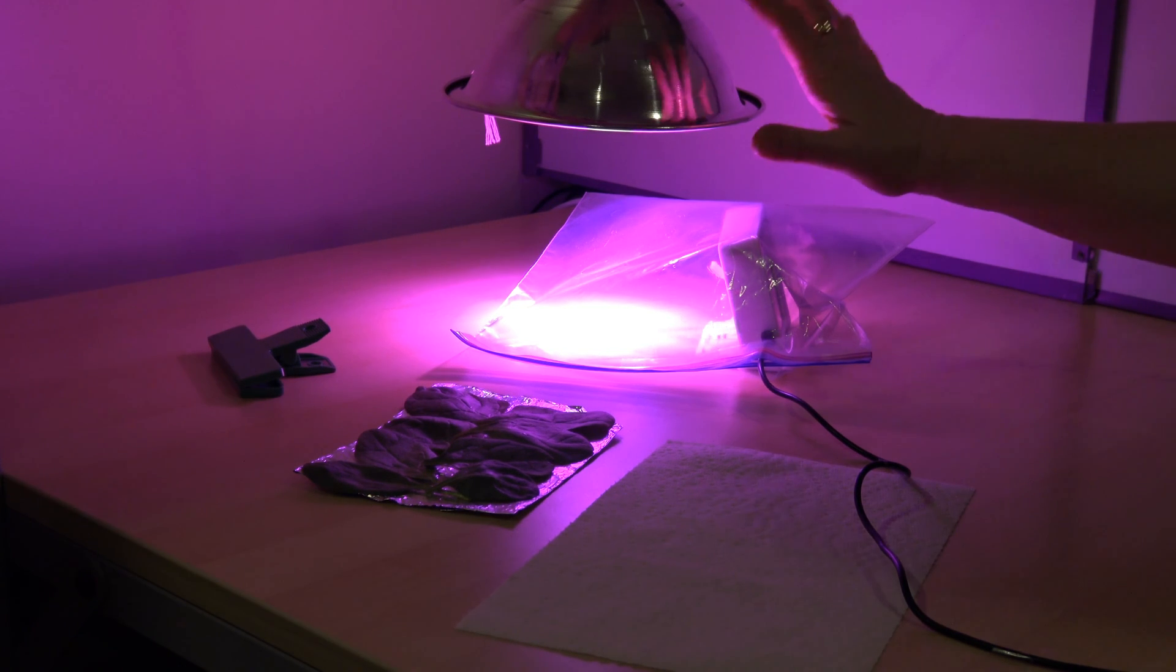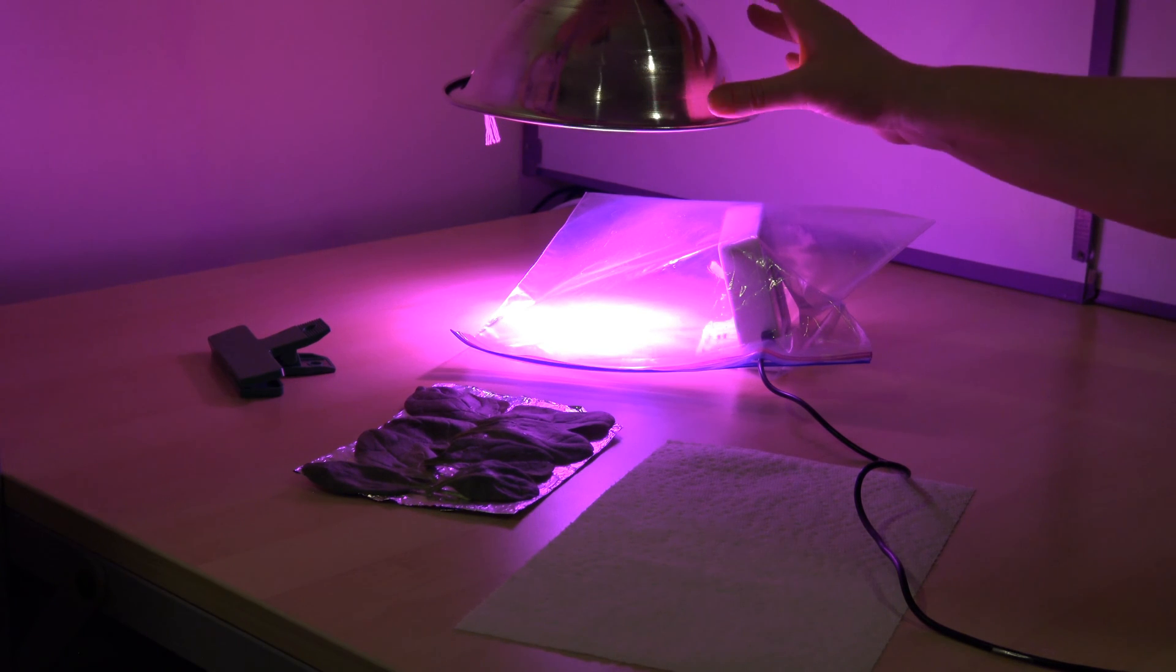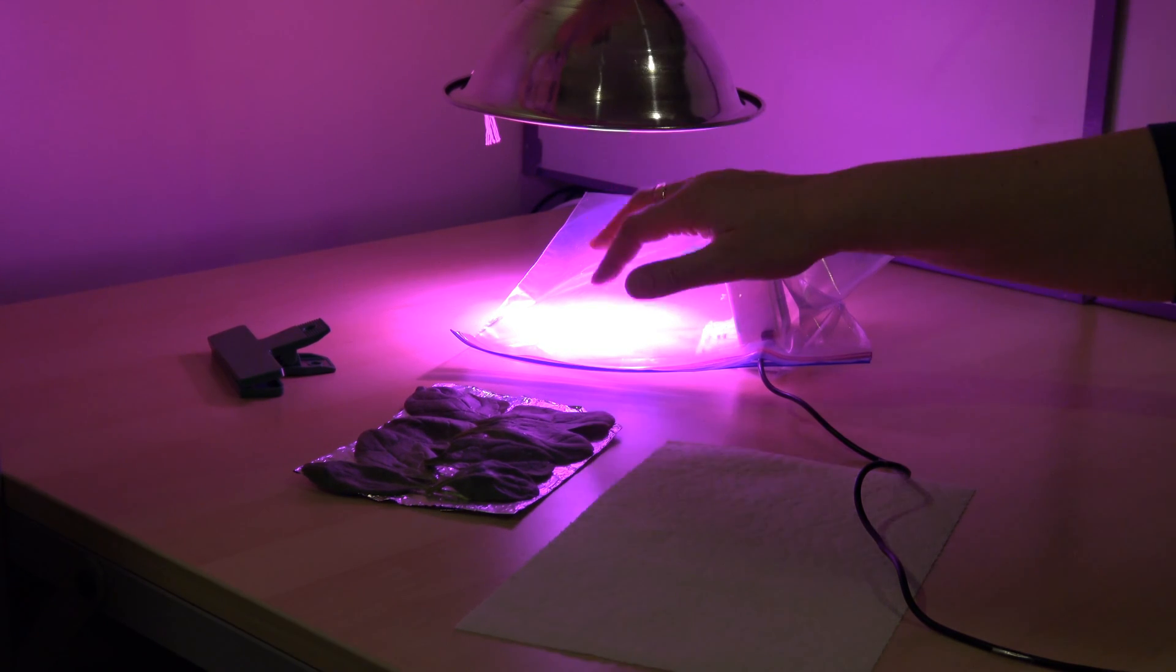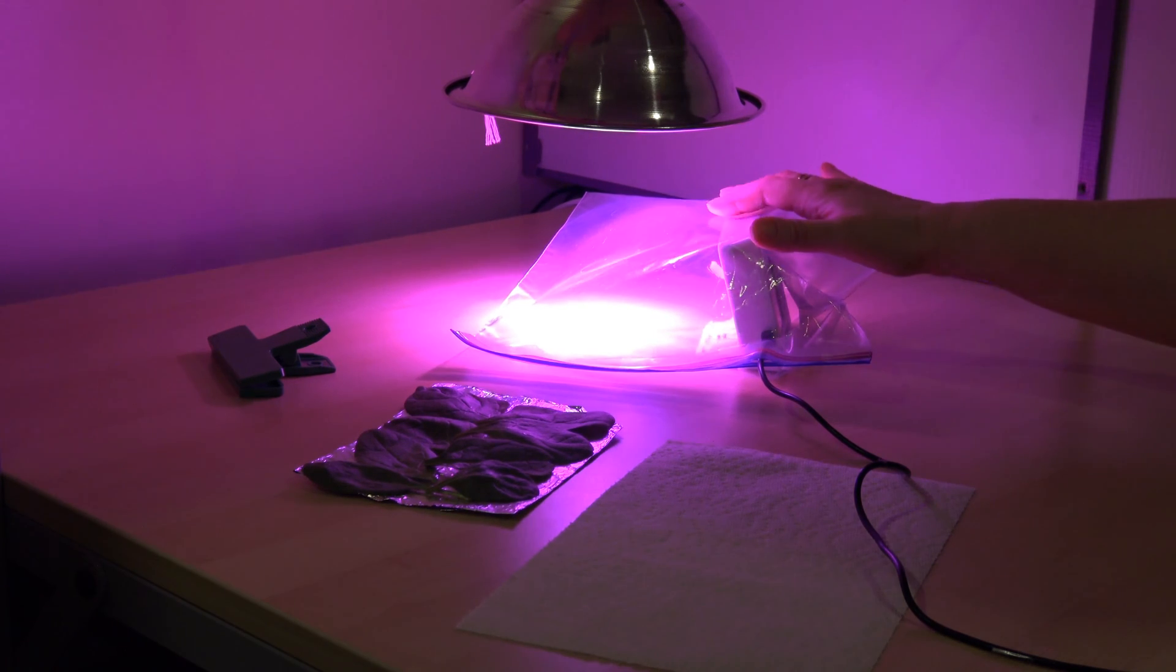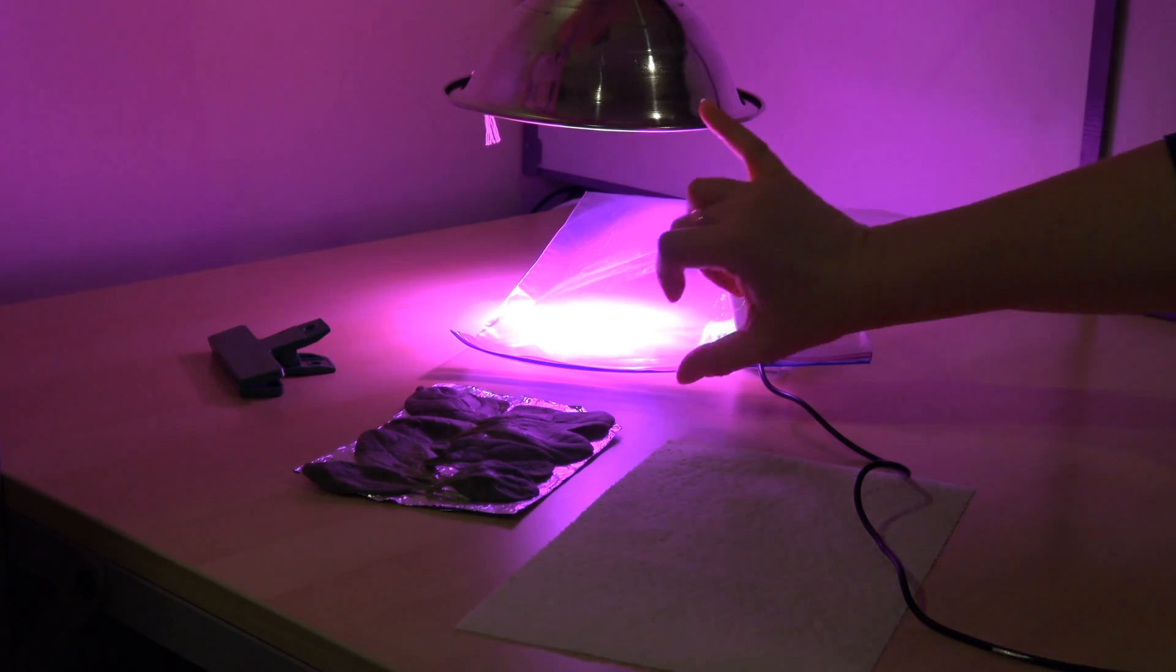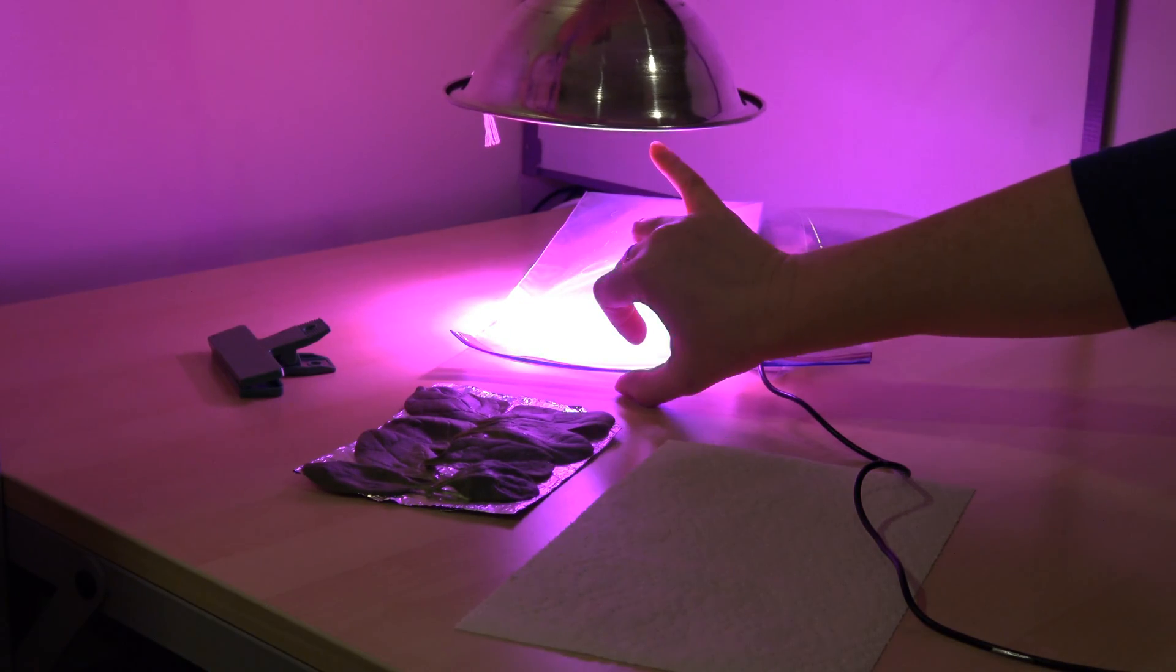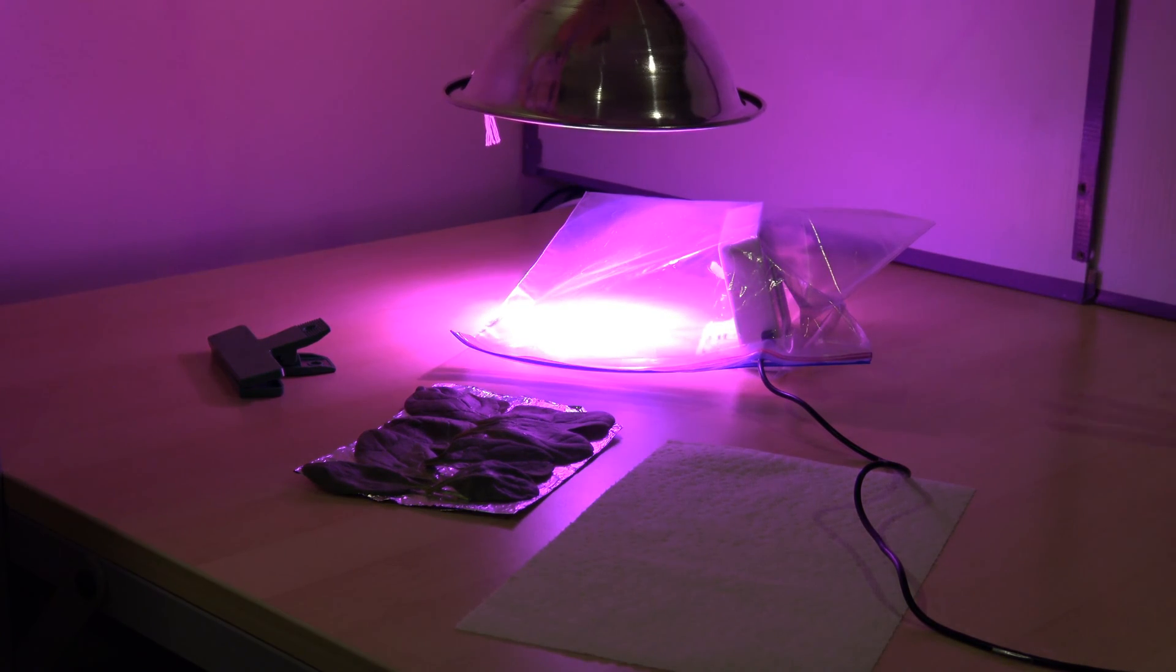Another thing I want to mention about the experimental setup is that in order to maximize photosynthesis we want as much light as possible directed on the leaves. So I've placed the bag and the detector right under our hydroponic grow lamp. Also the distance between the table surface and the face of the hydroponic grow light is about six inches.